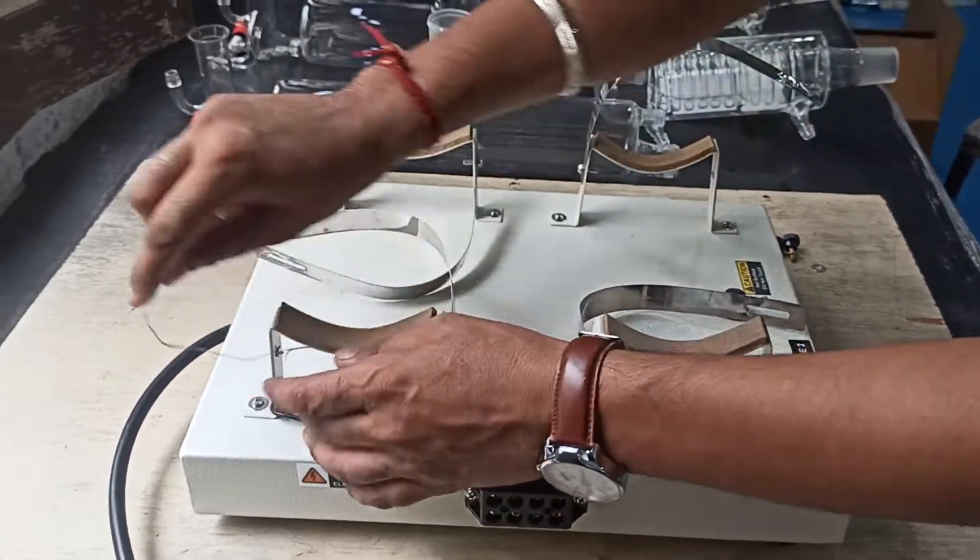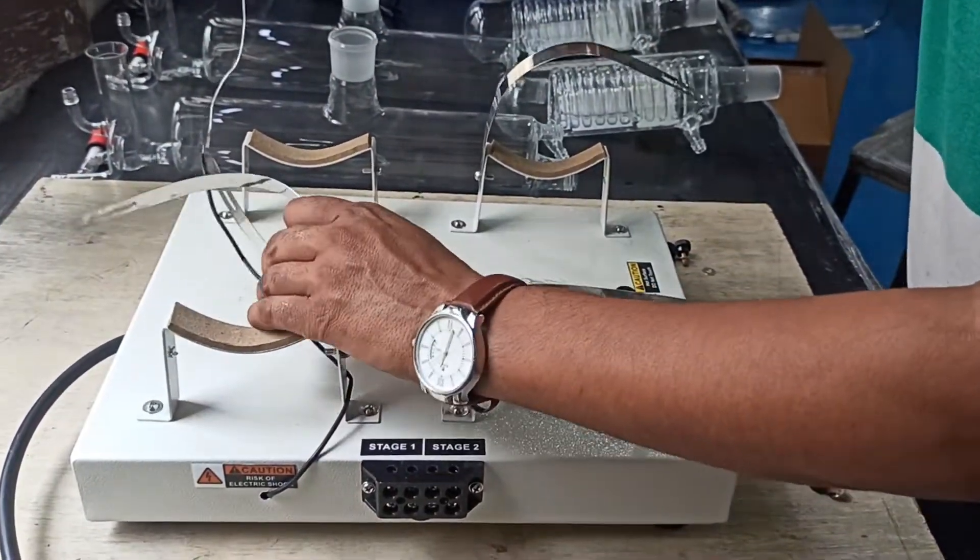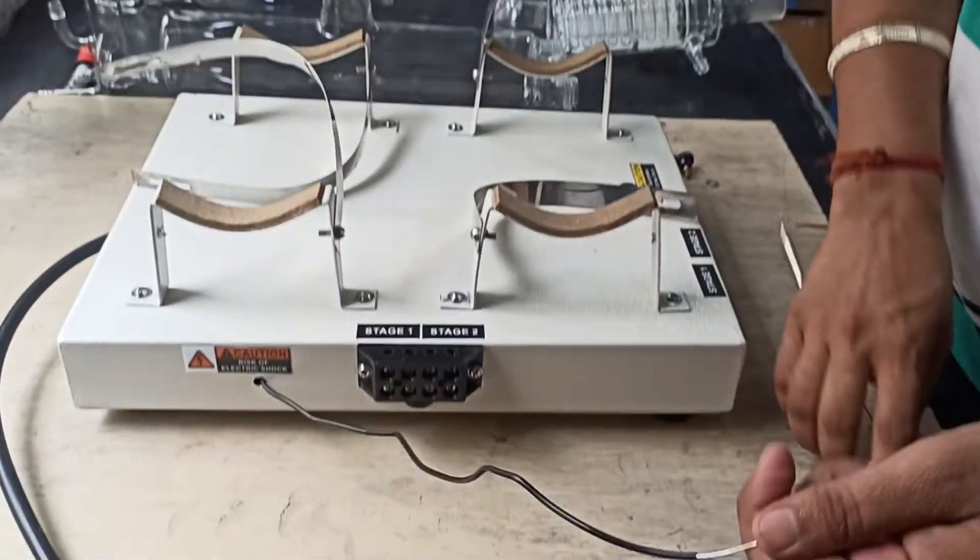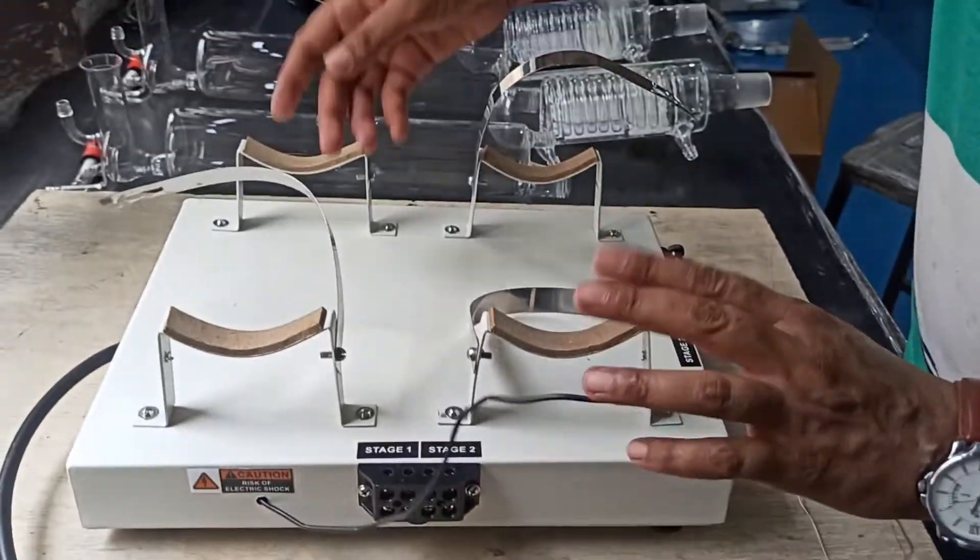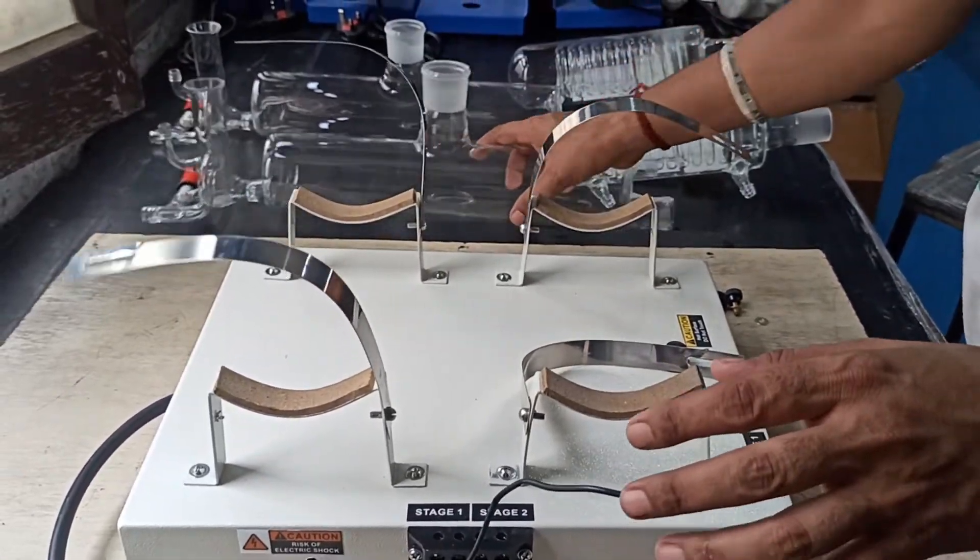Firstly, place the powder coated stand with clamps at a suitable location. Open the black headed knob screw from the boiler clamp and place the first stage boiler carefully.